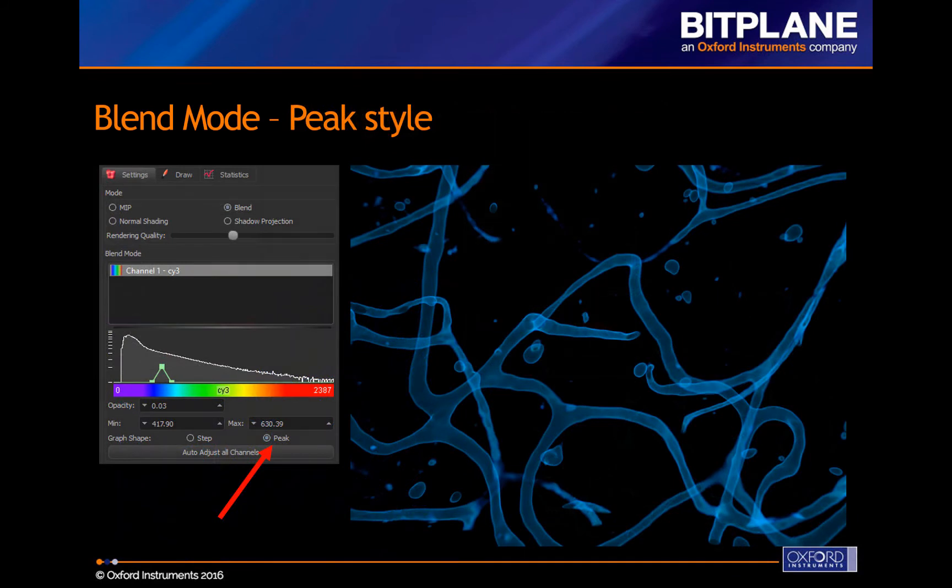And finally, at the bottom of the tab, you'll see a Peak option for the graph shape. Clicking Peak adds a third control point, and the rendering is now restricted to a band of intensity values. We've found this option to be useful while tracing neurons.